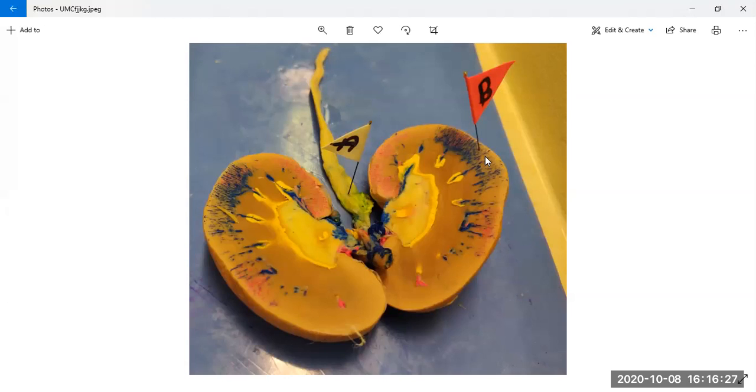And then we have the kidneys. The outer part is called renal cortex, especially the one with the blue color, like this one. The inner one is called renal medulla. This is the medulla. This is renal cortex. And this yellow semicircle is called renal pelvis.